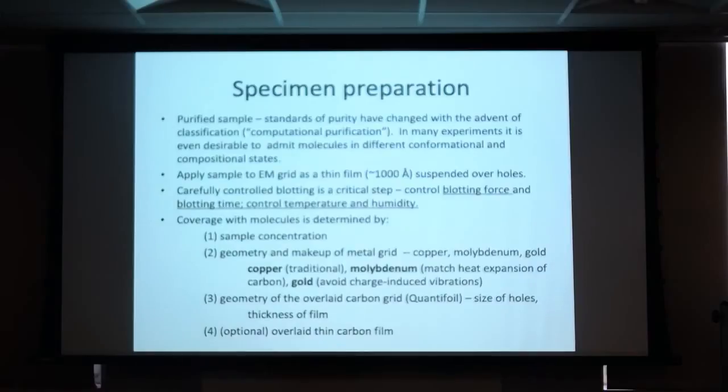Okay. So, specimen preparation. I just want to go through this here in steps. It used to be that we tried to get as pure as possible with a sample, but then with the advent of very powerful software programs, it is no longer so stringent because we have classification methods. You can call them computational purification. So in many experiments, it's even desirable to admit molecules in different conformation and compositional states, because that will tell you some kind of a story, okay?